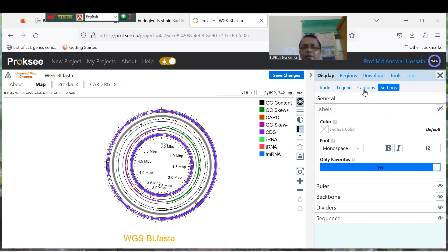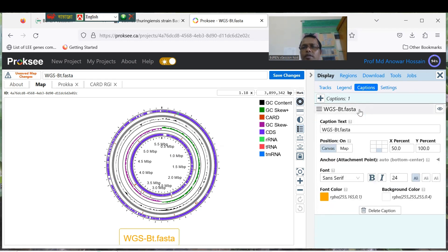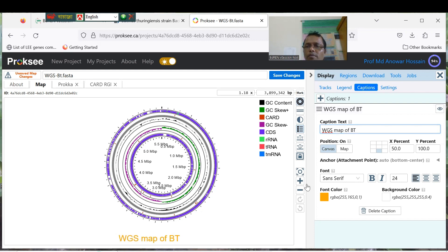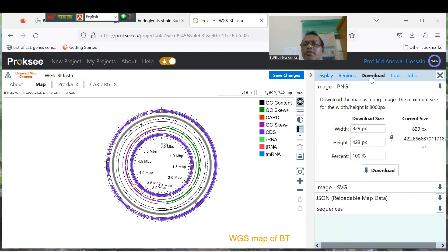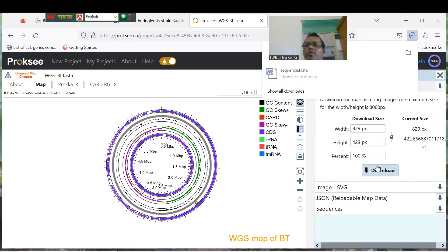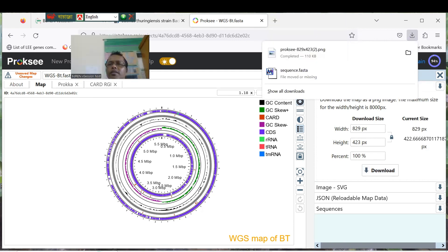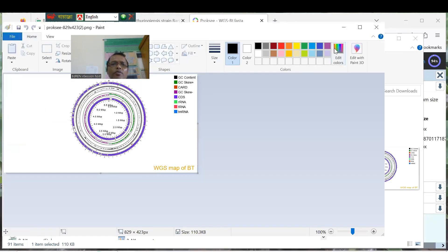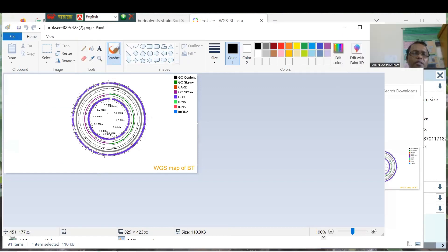You can add a caption — for example, write 'Whole genome sequence map of Bt' and put the strain name here. You can download this picture and use it for your genome publication.